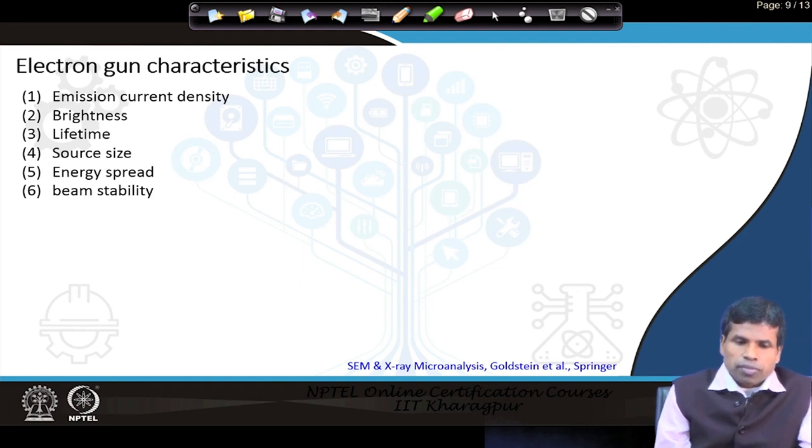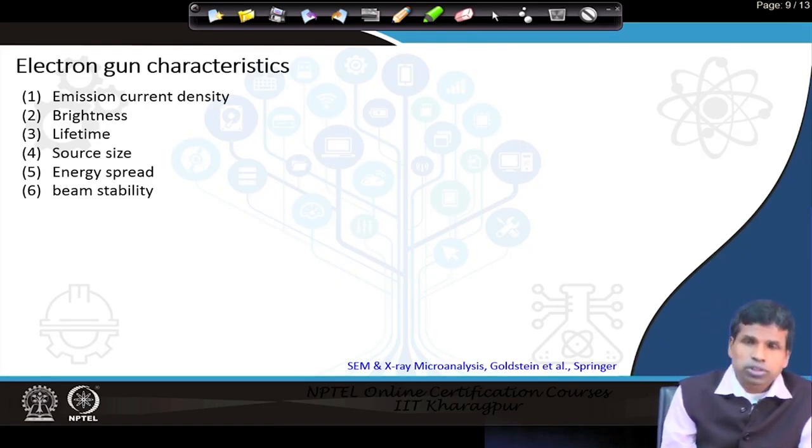Then, let's talk about the electron gun characteristics. These are the most important parameters of the gun, because they determine how much current it can produce and how stable that current is. That is the emission current density. And second is the brightness.